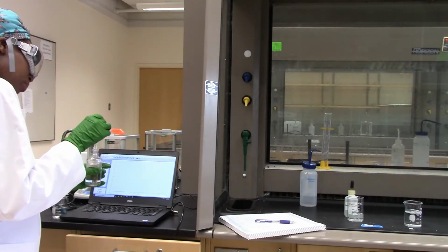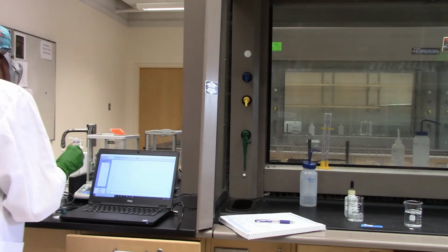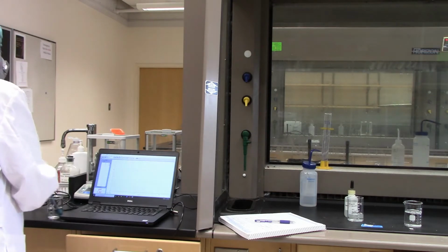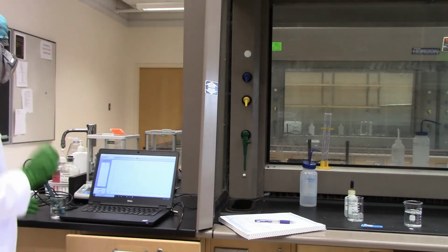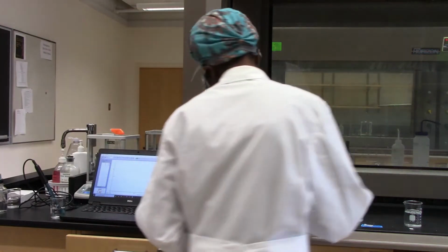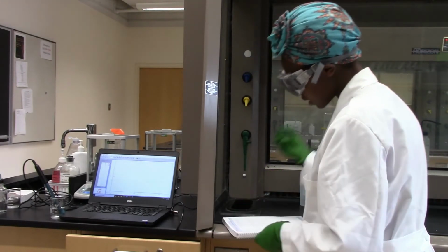Then finally I'll do a full dropper. Our final pH reading then is 1.46.